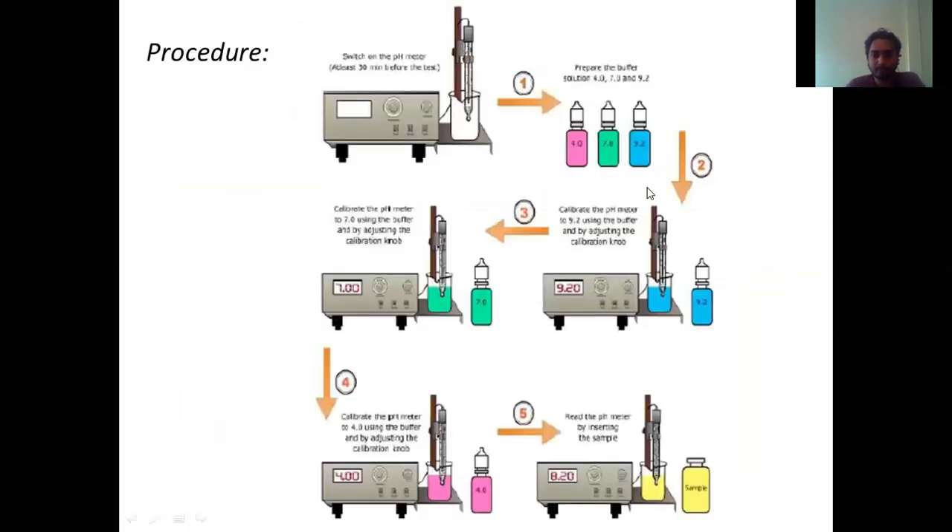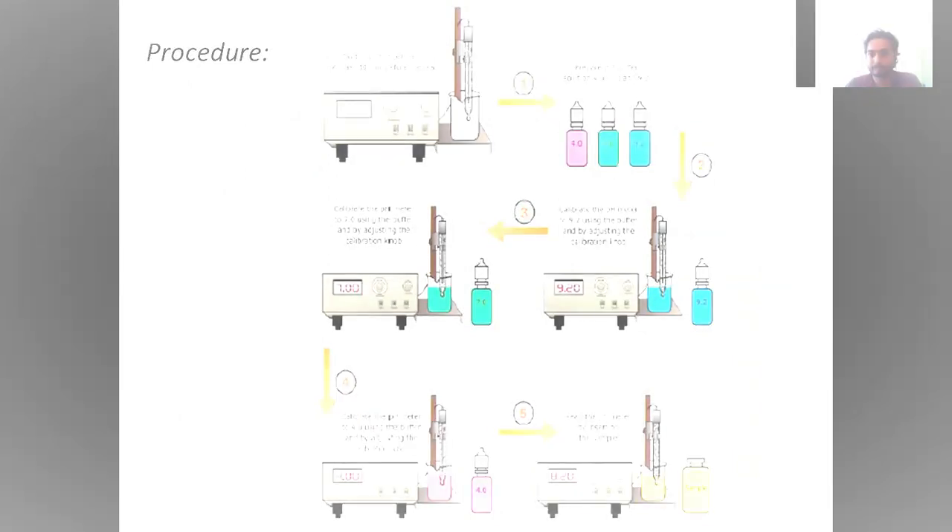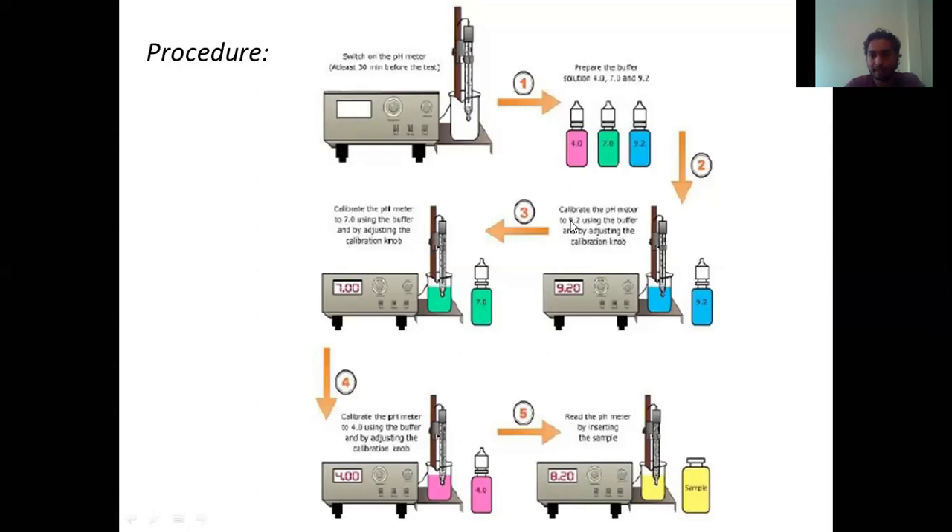After preparing the buffer solutions, we have to calibrate the equipment — the calibration process is more involved than the actual testing process. First, dip the electrode into the pH 9.2 buffer solution. You will get some readings — not necessarily exactly 9.2. So we rotate the calibration knob until it reads 9.2. As soon as it reads 9.2, we can say it is partially calibrated. Then remove the solution and wash this electrode with distilled water — always wash the electrode with distilled water between calibrations.